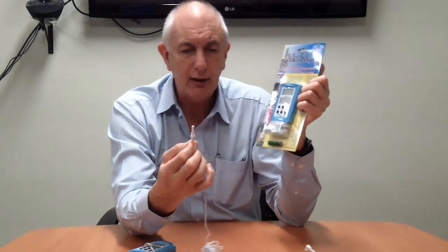It comes with a self-adhesive probe holder, so a little holder that will hold that probe in place, and a suction cap for holding the probe so they can place it in different fridges.